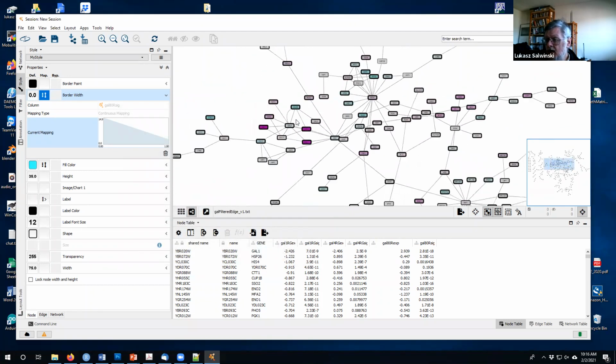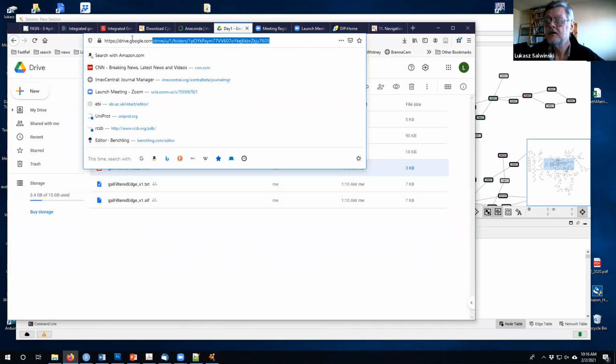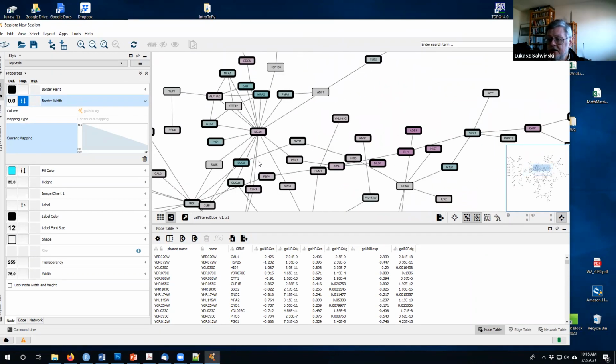And now we've got, oh, just a moment. I'm looking for the shared folder. Let's see, where is it? Okay, the shared folder is here. This is the one here. Copy. Okay, here it is. Hopefully it should work. Yeah. Okay, so that's the network.